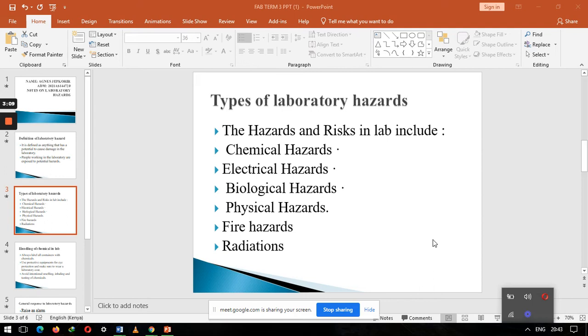Thank you, Deborah. We have radiation. And finally, we have what we call physical hazards and fire hazards. All these, I know you've come across in the laboratory. And because of time, we are not going to discuss them in detail. And I know you have a clue of them.